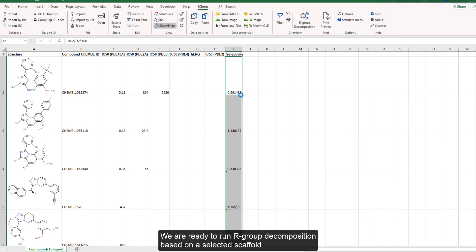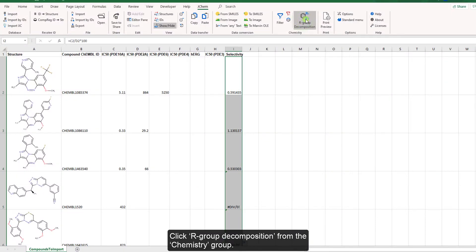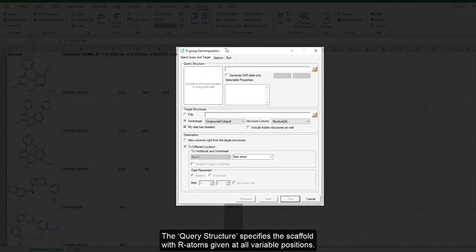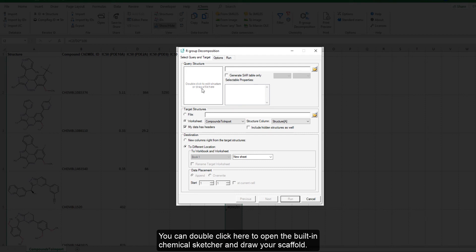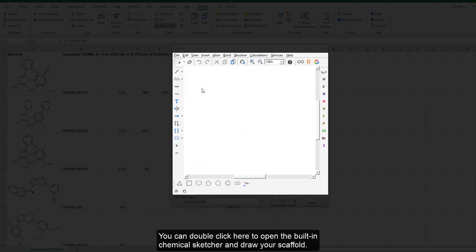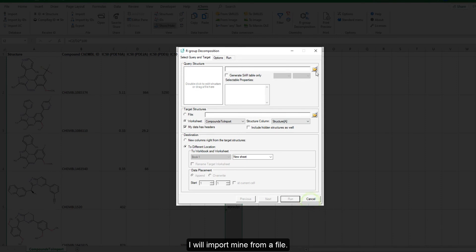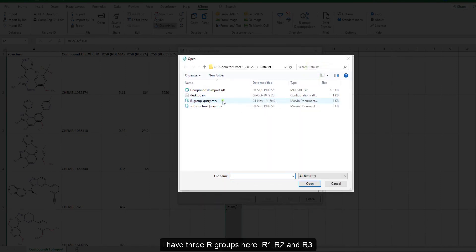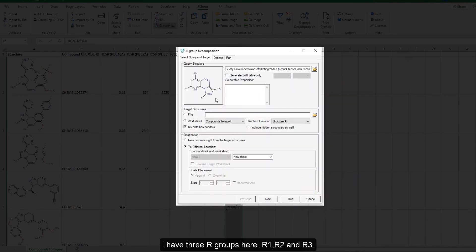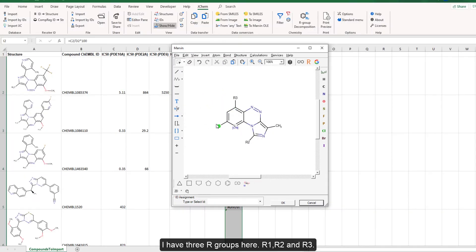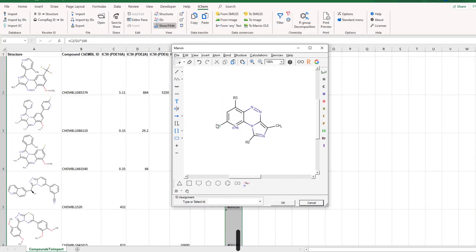We are ready to run the R group decomposition based on a selected scaffold. Click R group decomposition from the chemistry group. The query structure specifies the scaffold with R atoms given at all variable positions. You can double click here to open the built-in chemical sketcher and draw your scaffold, or import it from a file. I have three R groups here: R1, R2, and R3.